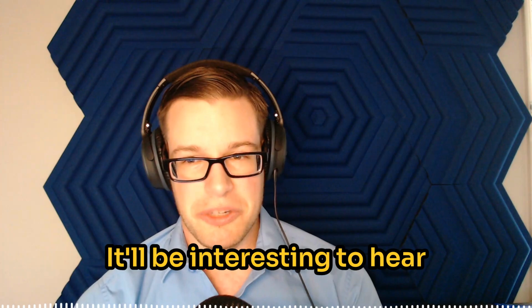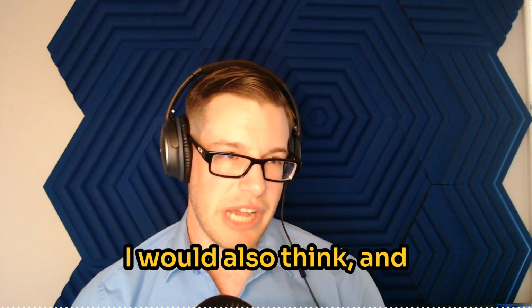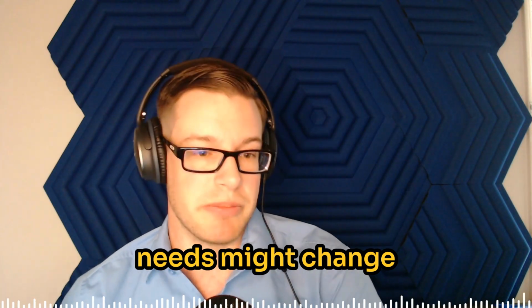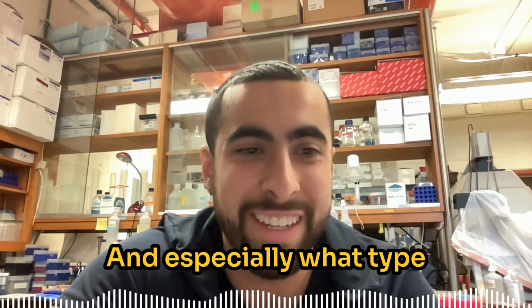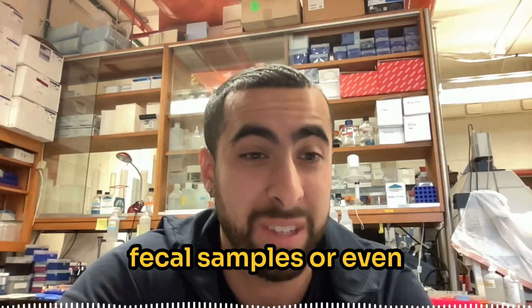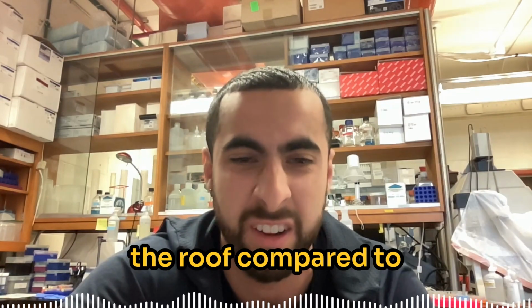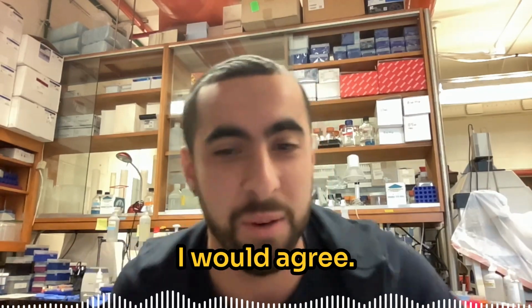It'll be interesting to hear how this progresses and I would also think, and correct me if I'm wrong, but your sample prep needs might change based on that switch pretty considerably. I figure they would, and especially what type of sample we use, whether we want to collect human fecal samples or even mice samples, the cleanup would have to go through the roof compared to in vitro batch approach where we're using a low sample biomass. I would agree with that.